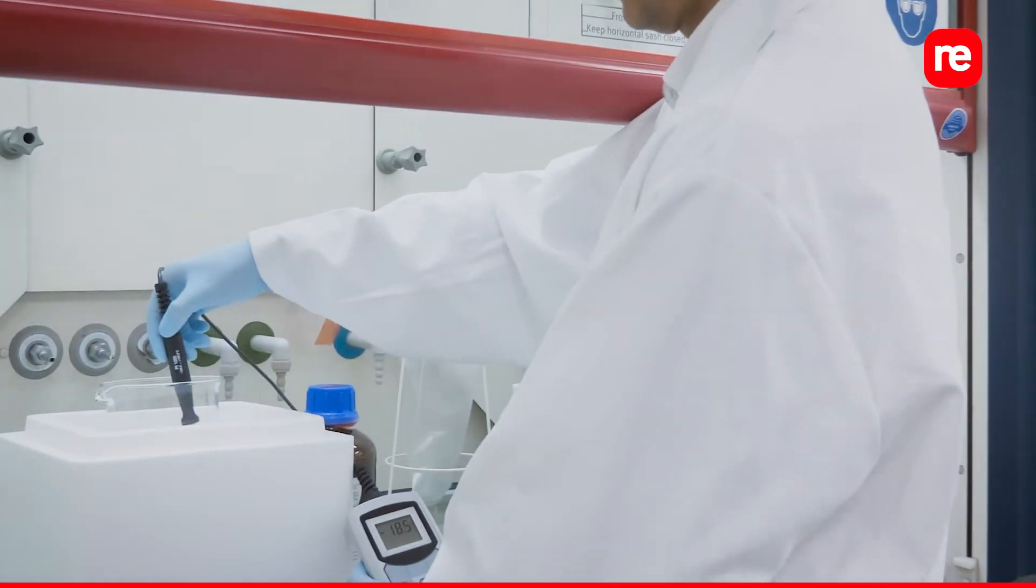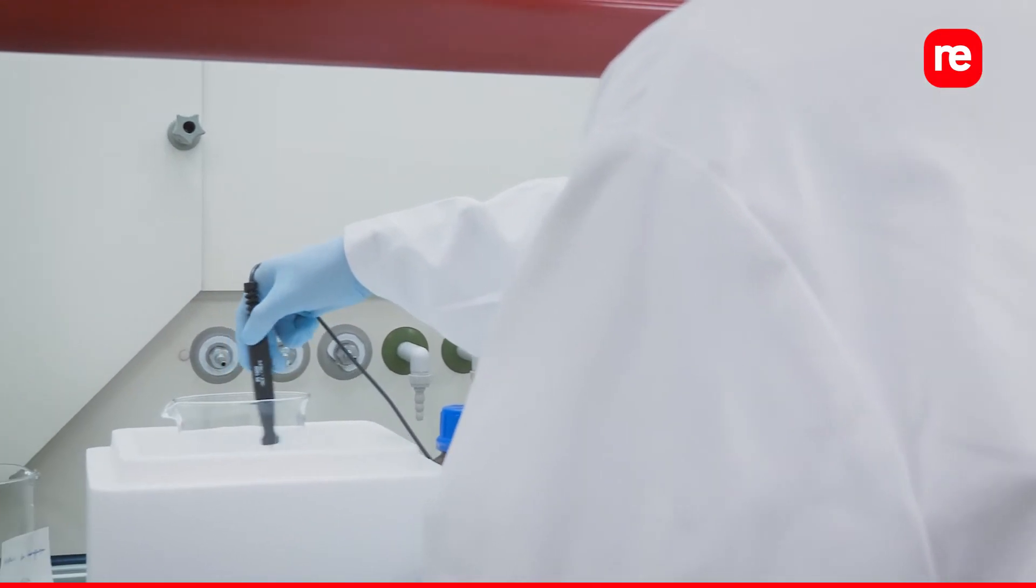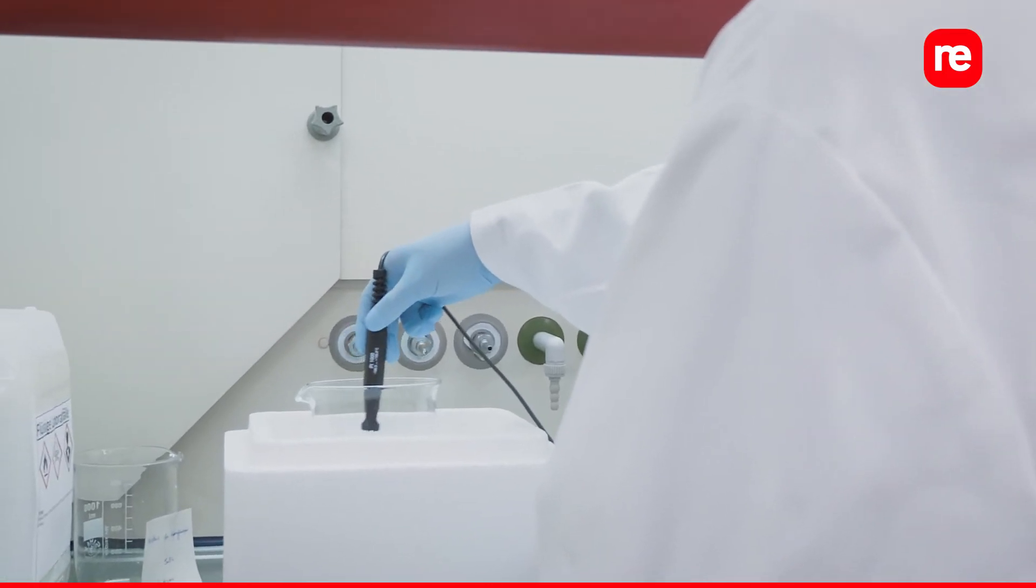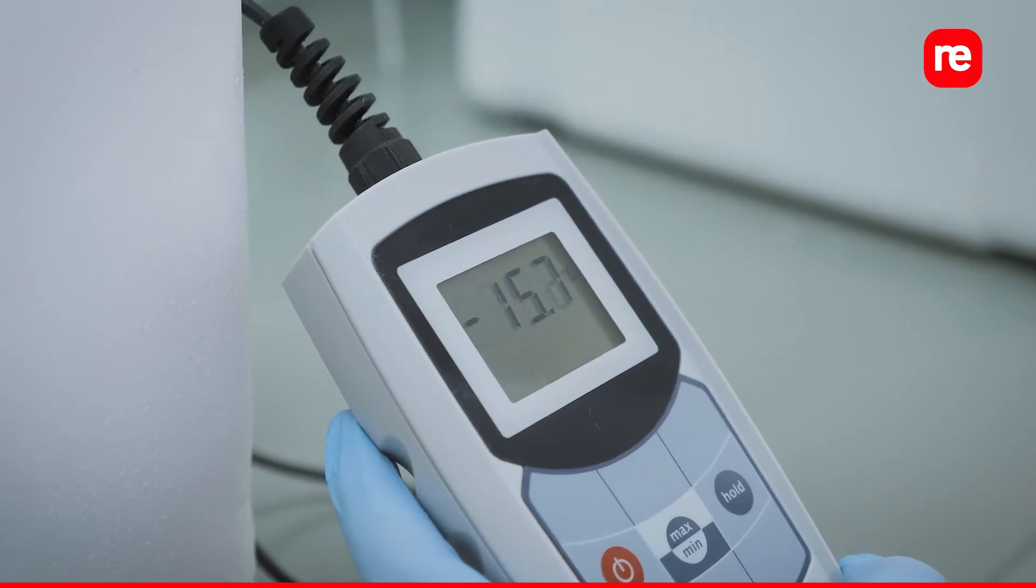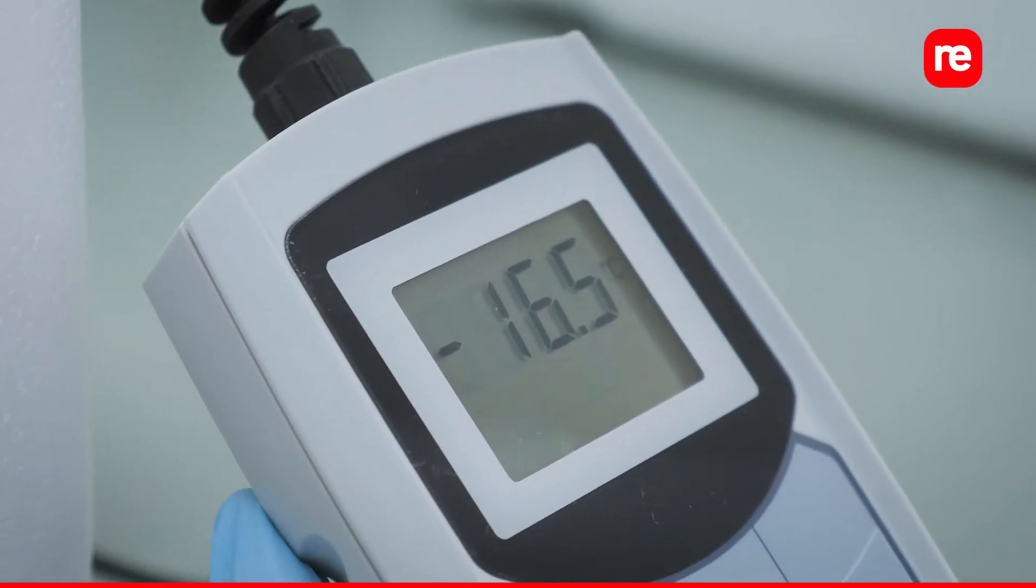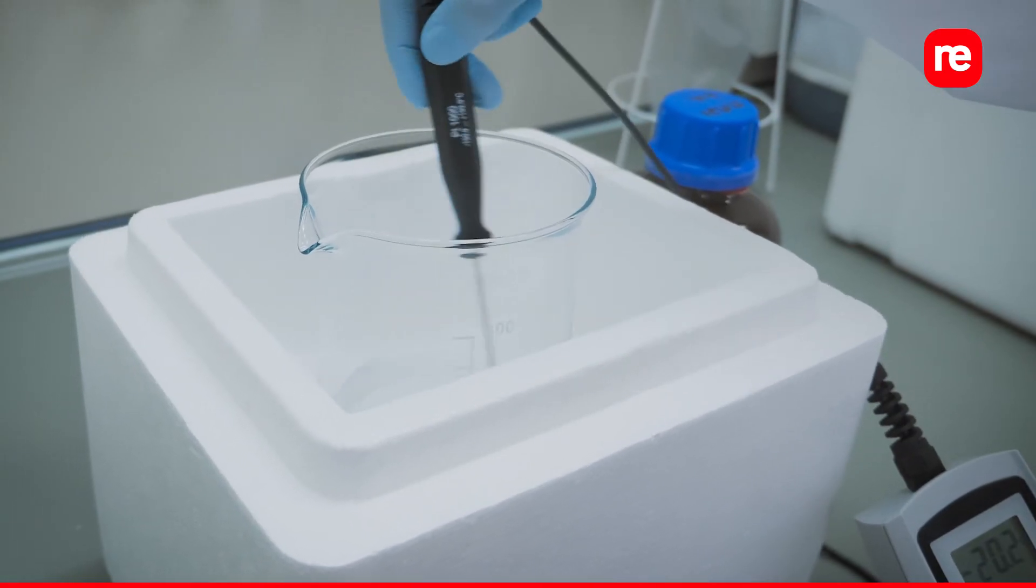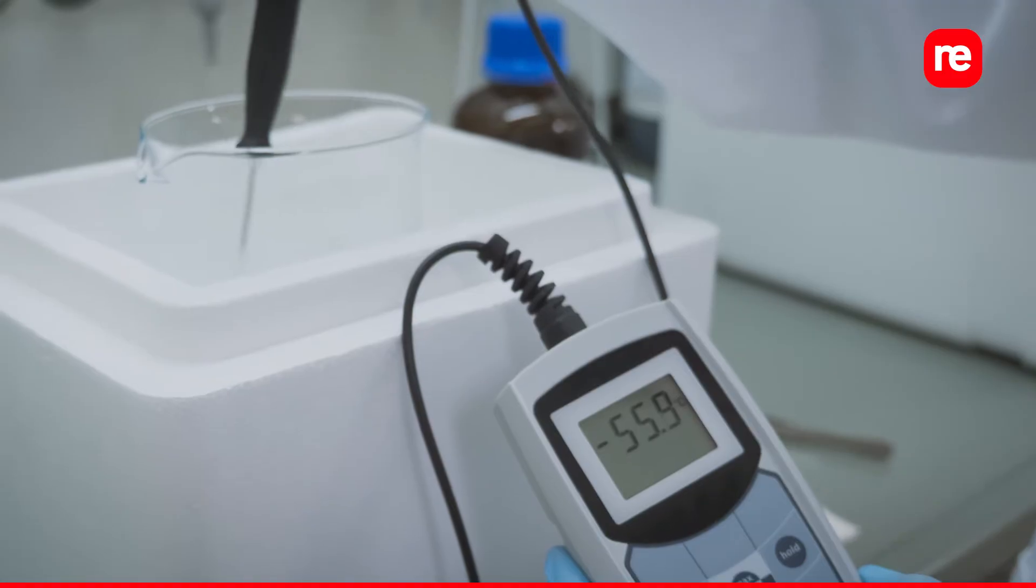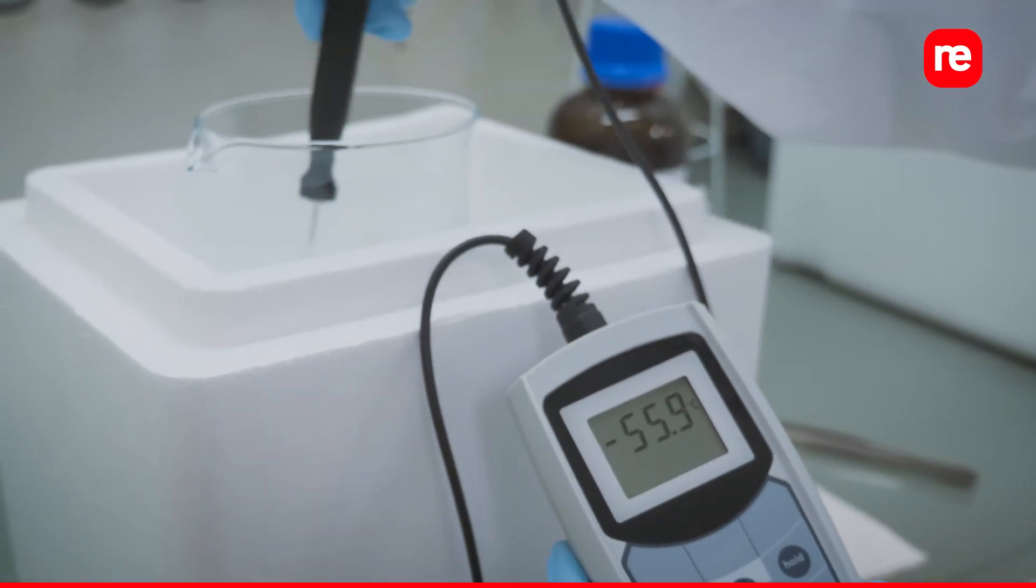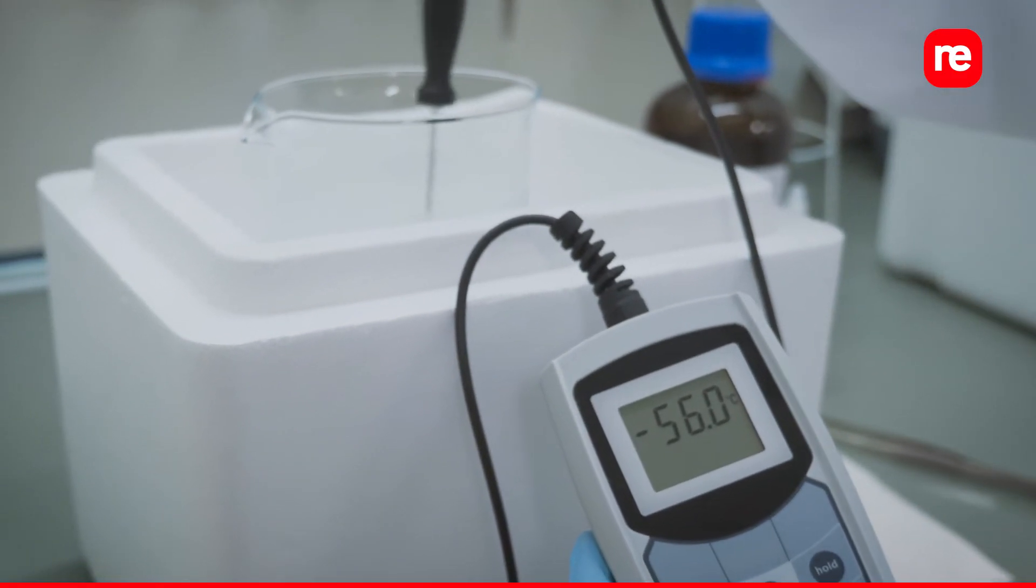Now back to our isopentane setup. Make sure to stir the liquid regularly to ensure a homogeneous temperature. For convenience, we use a thermometer for this to simultaneously measure the cooling progress. Ensure that the isopentane is evenly cooled to approximately minus 55 degrees Celsius.